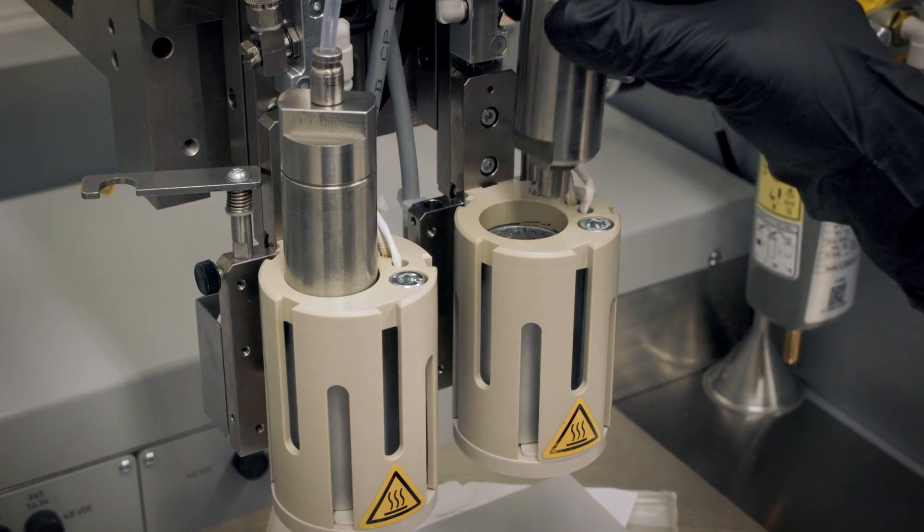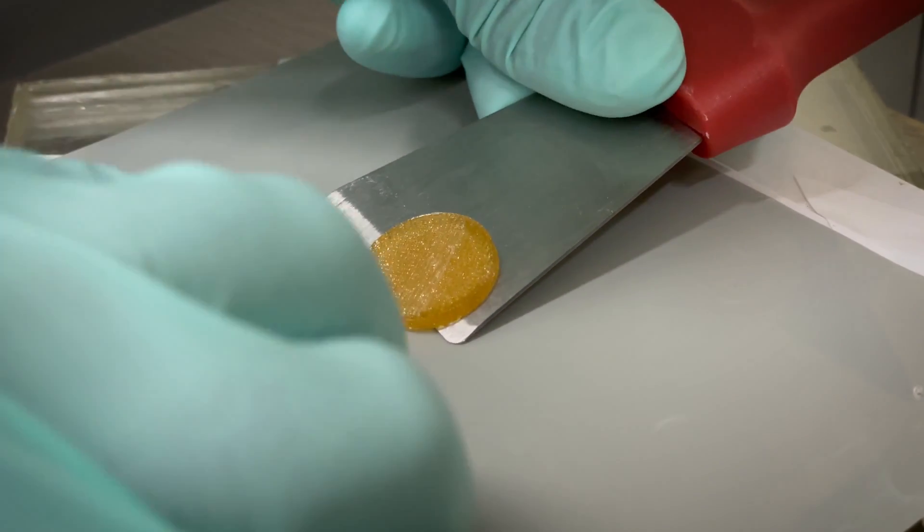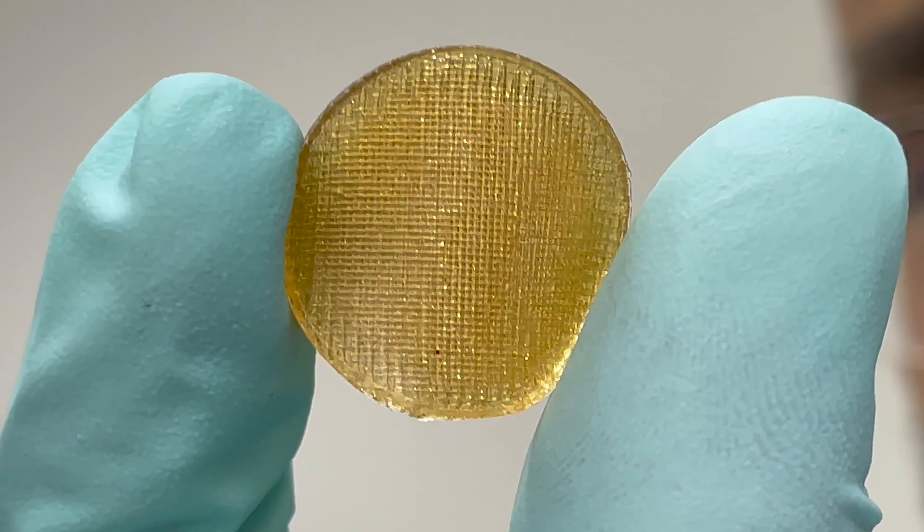When you don't have a 3D printer and you can't make the right form factor of the material, things that seem easy are actually quite challenging and only enabled through a 3D printer. Having the 3D bioplotter has really opened up the possibility that any polymer we make can now be 3D printed.